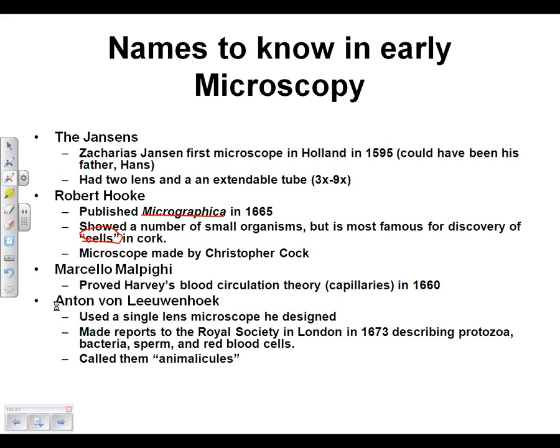And the sort of interesting thing in all this is, most of those microscopes above were actually versions of the compound microscope. The interesting thing was von Leeuwenhoek, who used a single lens microscope. So that funky little thing, the very first one I showed you, that didn't look anything like a microscope, because all it really is, is a huge magnifying glass.